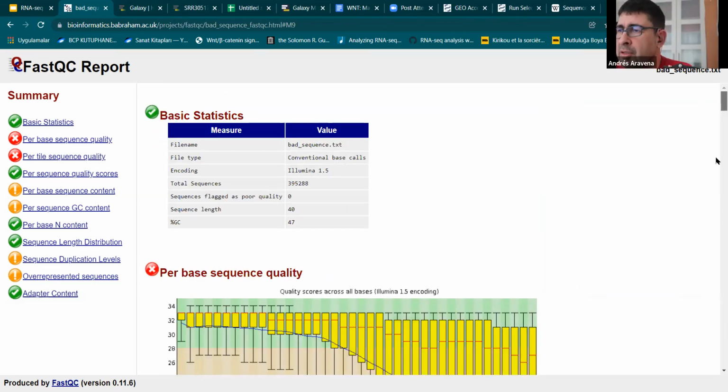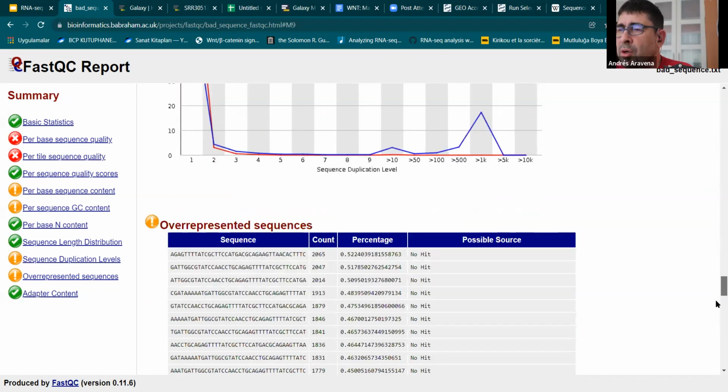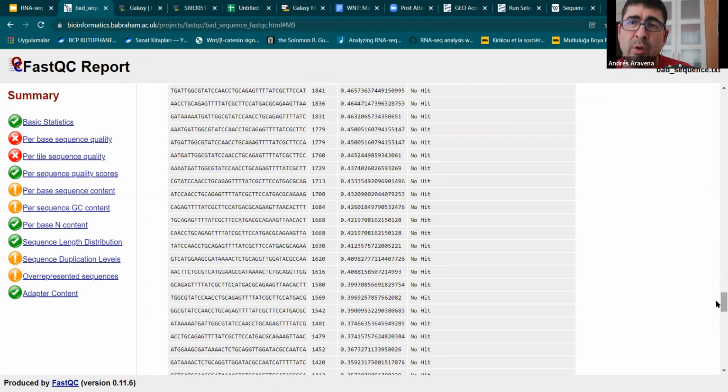So what we can, I want to make a couple of comments. First, I don't know how much we need to explain, how much people need to know about quality. The point is that everybody understands what is here, or shall we explain a little more what we call quality here? Can I also interrupt for us?